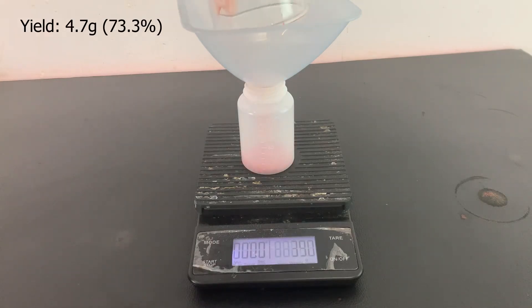Once the methyl orange is dry, I measured the yield I got. I got 4.7 grams of product which is a 73.3% yield based on the starting amount of sulfanilic acid.